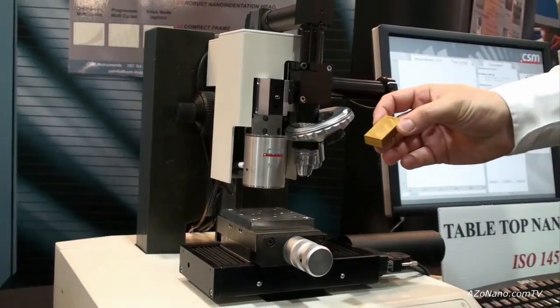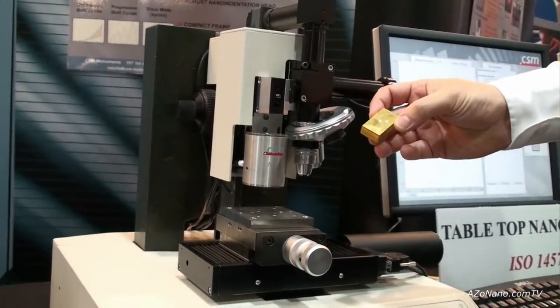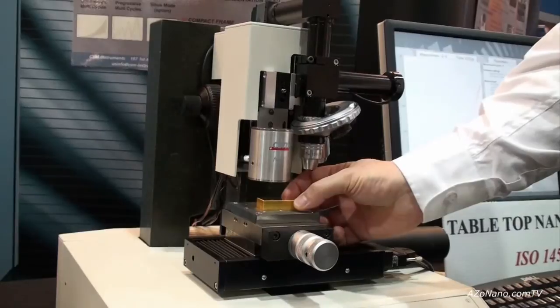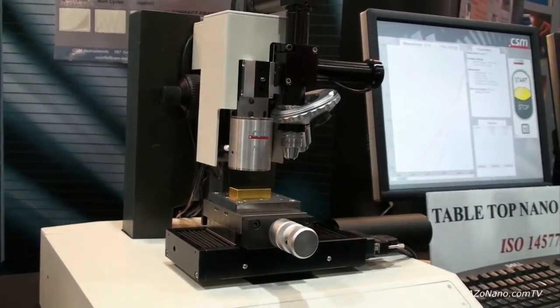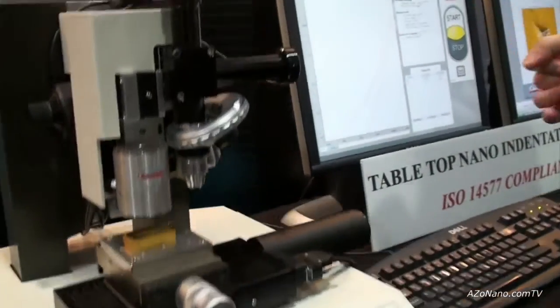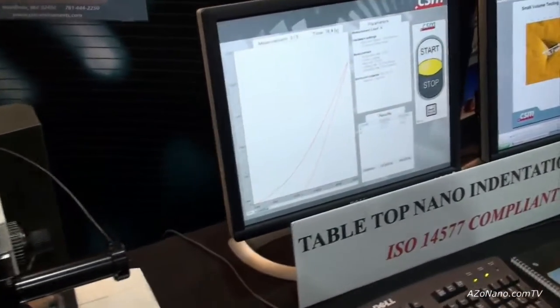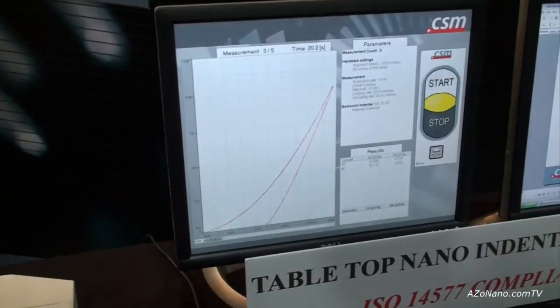It means you can take a sample like this one here. This is a coated steel component. The technician or whoever's running the machine can just stick the sample on, press a start stop button and basically the machine fully automatically does a pre-programmed line of indentations.